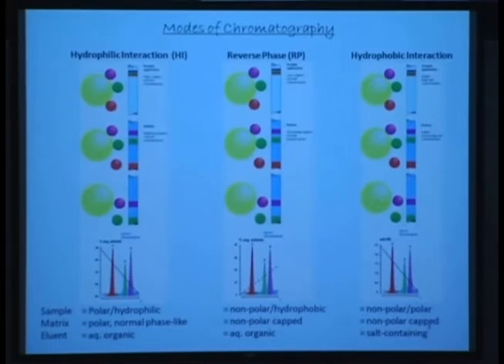So as you decrease the concentration of the organic solvent, what do we do? We increase the concentration of water. So water then replaces the hydrogen bonding capability of the glycans, and that is how resolution occurs. This is a technique that is gaining in usage quite a bit, especially for N and O glycans.